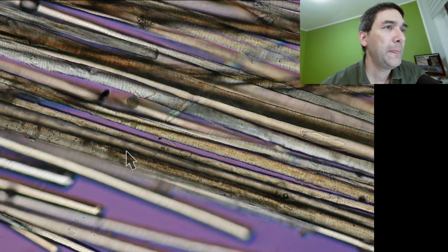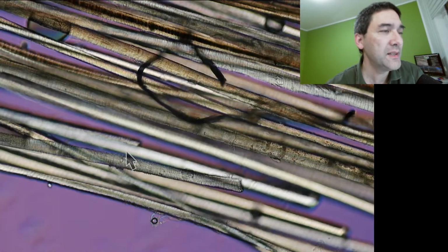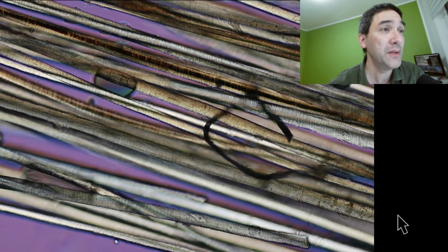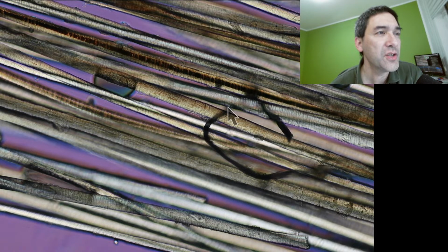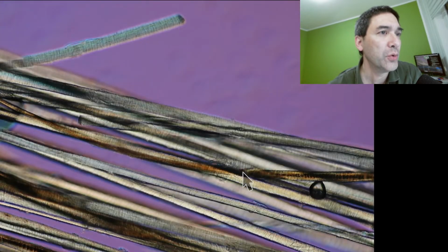You know that I'm also occasionally interested in finding microplastics and other contaminants in whatever I look at. One way of distinguishing them is that contaminants, either artificial or natural, are often much thinner and not as straight as here. So all of those fibers that you occasionally see are in many cases not animal fur, but could have other origins.